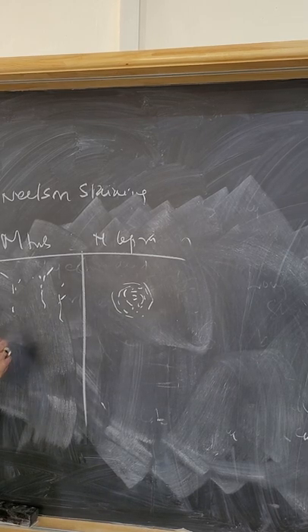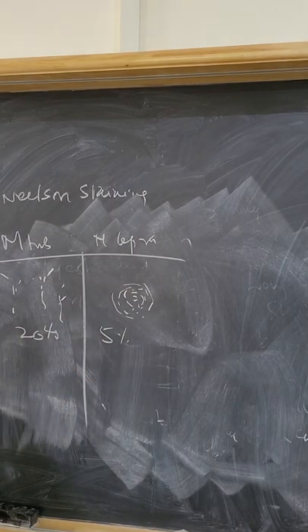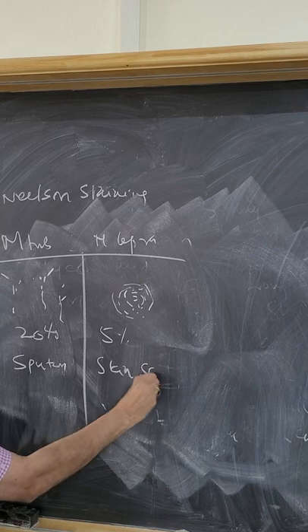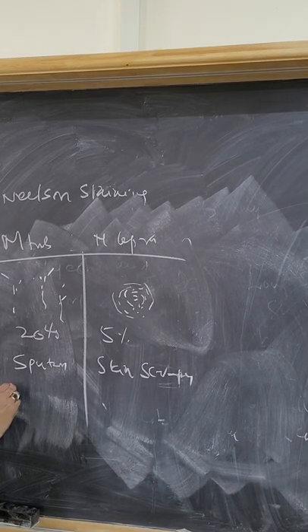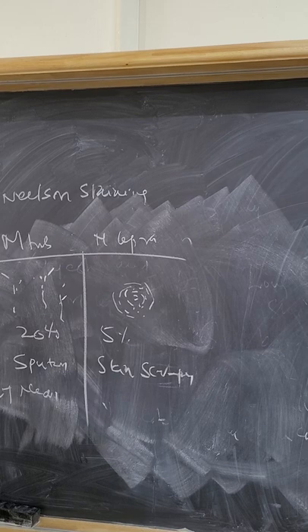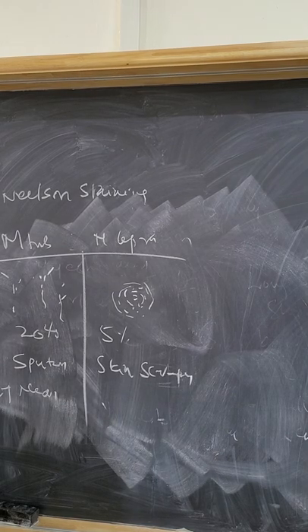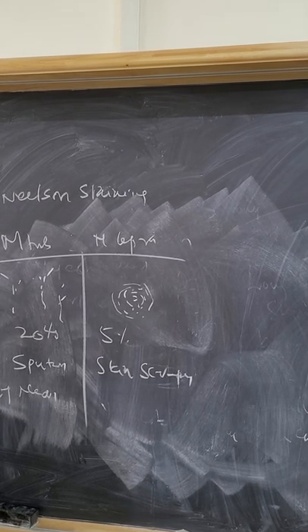This is 20% acid fast. This is 5% acid fast. The sample can be sputum here, and skin scraping there. Here it can be grown in Lowenstein-Jensen medium. The medium consists of beaten egg, asparagine, malachite green, mineral salt. It is sterilized by inspissation, partial sterilization, tyndallization, at 80 degrees for 3 successive days.